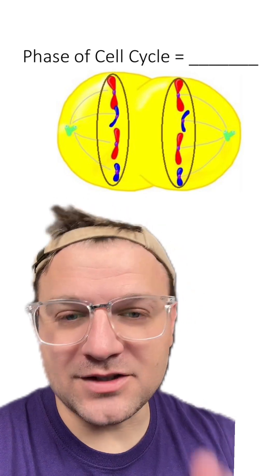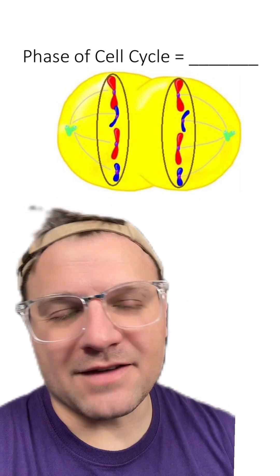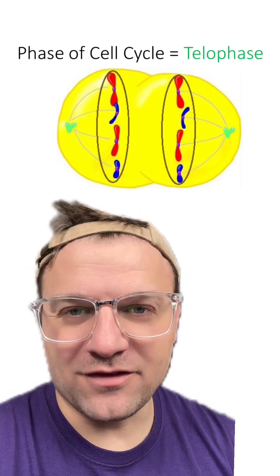Here's our next cell. This is towards the end of mitosis, where the two nuclei have started to reform. This cell is in telophase.